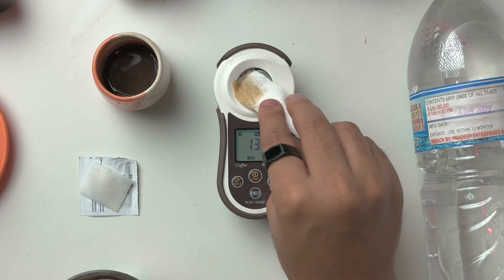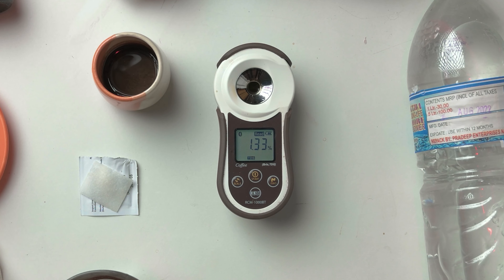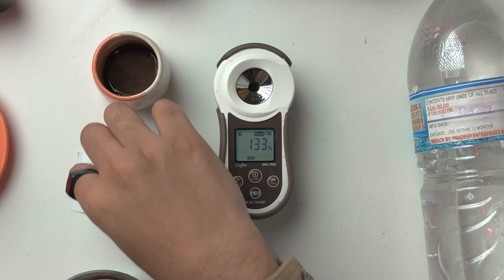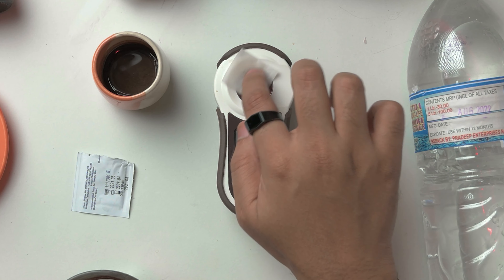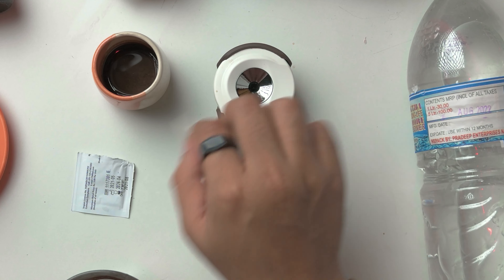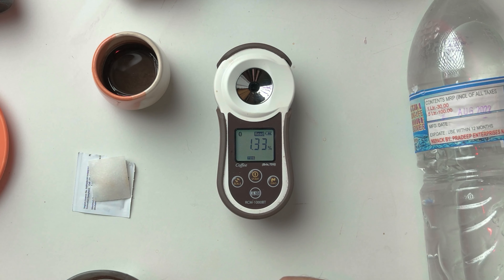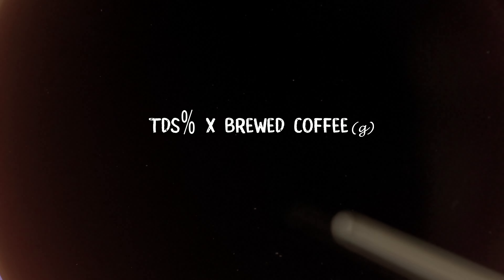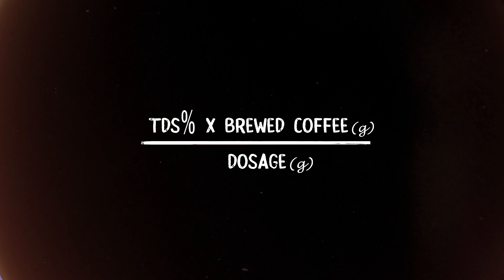Now take the pipette, take some coffee, and make sure you mix it well. You also want to cool the temperature down a little bit. Take a little bit of coffee and pour it over the lens of the refractometer. Once it's there, press the start button and wait.